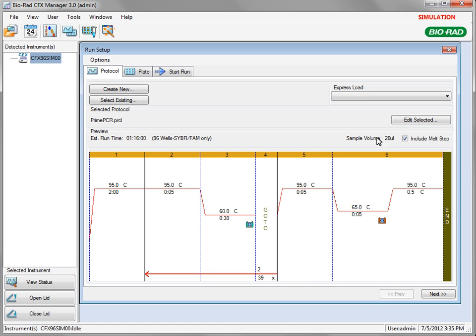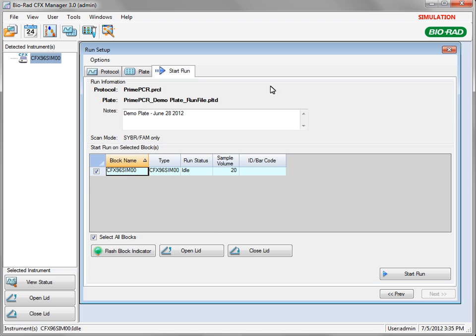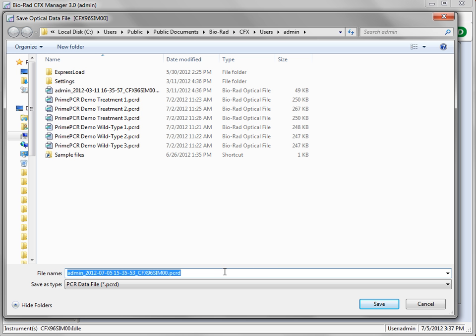The Plate tab displays a preview of the plate layout for your sample types. You can edit the plate layout at this time if needed. After confirming instrument selection, start the run by clicking the Start Run button. Use the default data file name or type a new one and save it in the appropriate location.